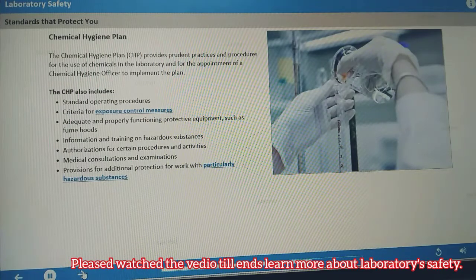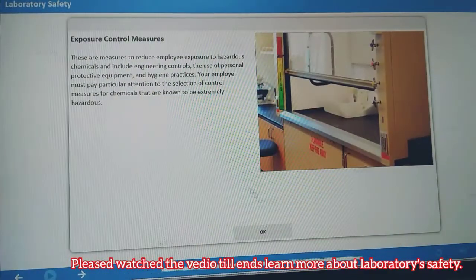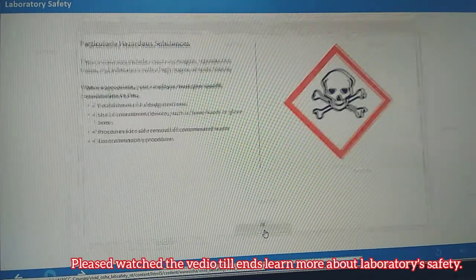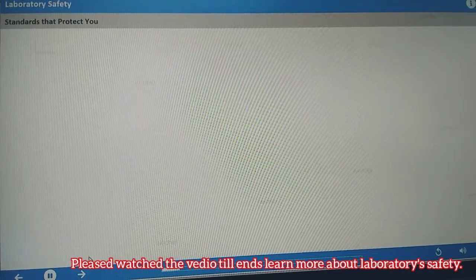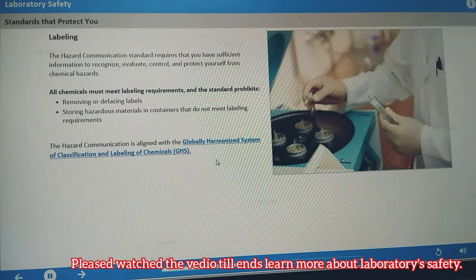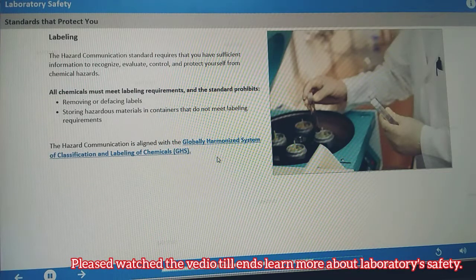The Chemical Hygiene Plan must include provisions for exposure controls and particularly hazardous substances. The Hazard Communication Standard protects you from illnesses and injuries from chemical sources by ensuring you have sufficient information to recognize, evaluate, control, and protect yourself from chemical hazards. The standard requires that every laboratory identify hazardous chemicals in the workplace and that all chemicals meet labeling requirements. The standard prohibits removing or defacing labels or storing hazardous materials in containers that don't meet labeling requirements.